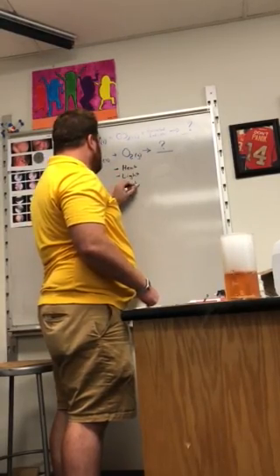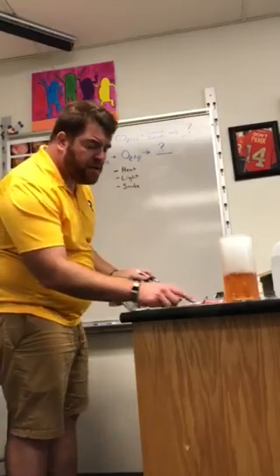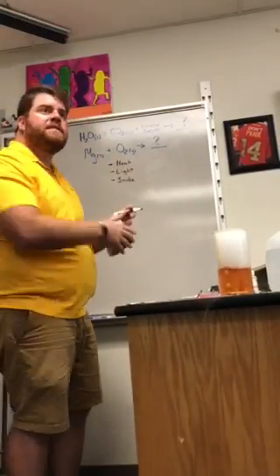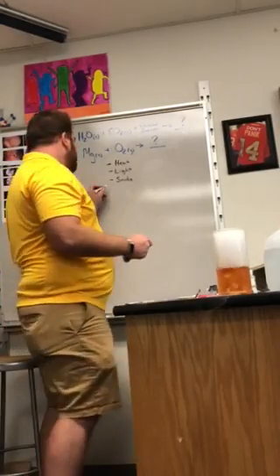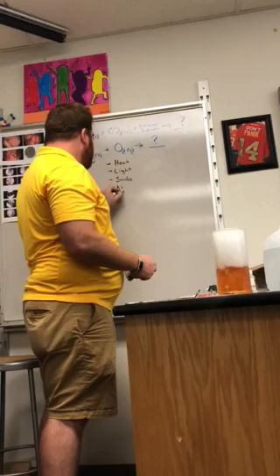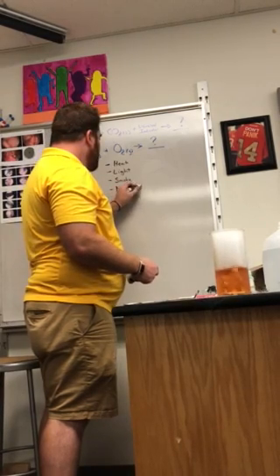Can we do it again? We also created a new substance, which is right here, this little powder material that's white, okay? New substance. That new substance is what you're going to look up, okay? So it's a new substance. Ash?